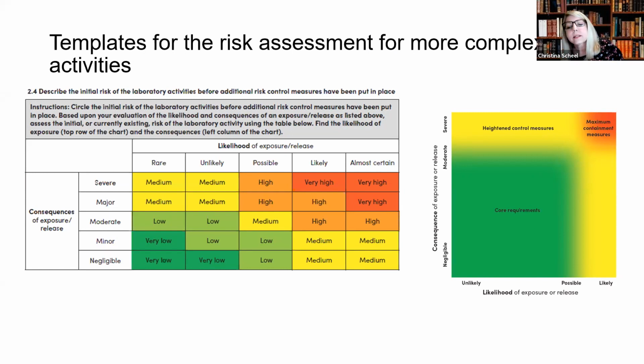On the right-hand side, beyond the table, you can see that although we have these categories describing consequence, likelihood, the levels of those, low to high, and also the risk, it's more of a continuum, that it's not exactly that cut and dried.